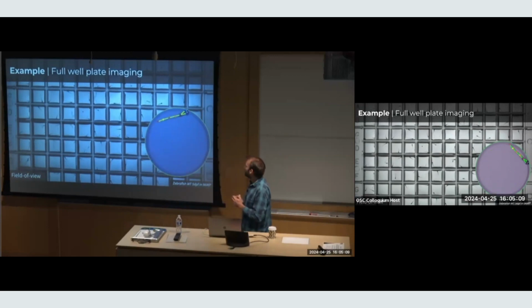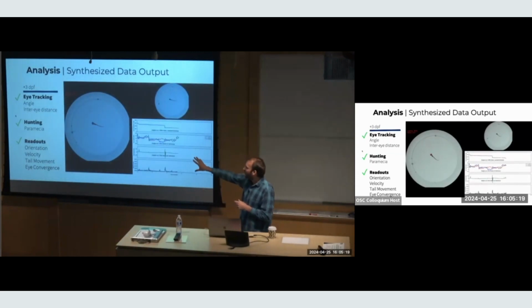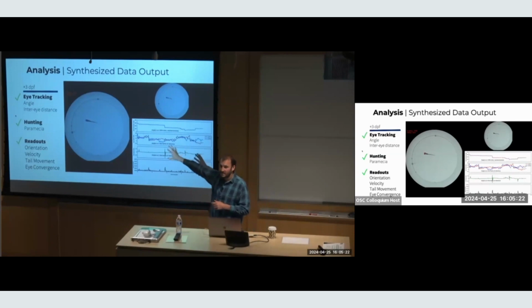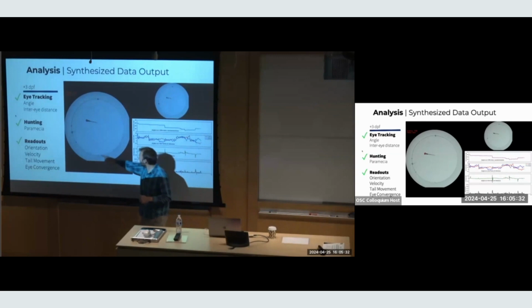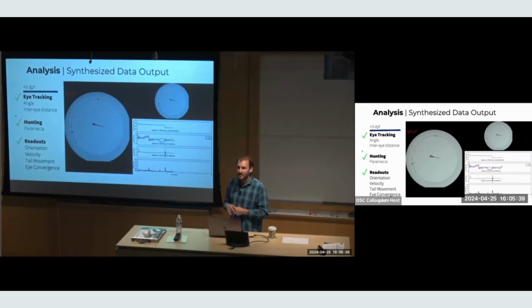And then we've been developing tracking software to follow these organisms around to report key statistics. This is one well, but we are capturing 96 of these all simultaneously with this camera system. We can track this zebrafish larvae, and you can see these little black dots barely moving around, maybe. Hopefully, those are paramecia. That's what it eats. So we're observing its hunting behavior and then testing drugs, how those impact the hunting behavior, including Ozempic, actually. I'm not in charge of that study, but the collaborator is interested in how Ozempic impacts zebrafish appetite.